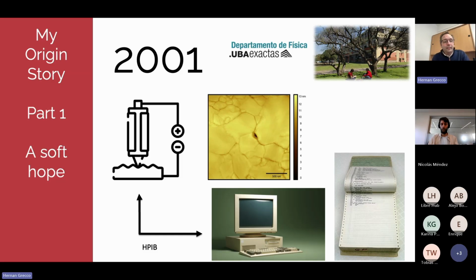That computer was dying, and we needed to migrate that software into something new. Therefore, what we did at that moment is, because we had the source code of the software, and we were also able to put a sniffer on the HPIB cable, we were able to rewrite the whole software using LabVIEW, which is the National Instruments tool to build instruments.